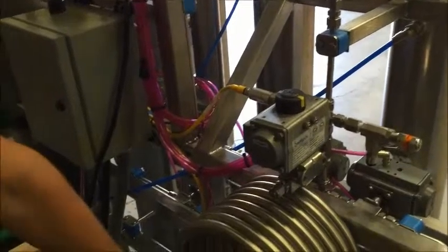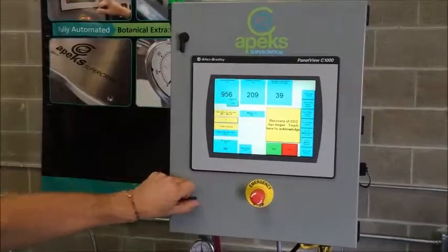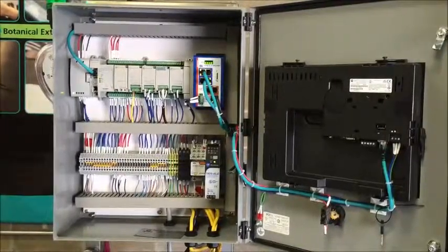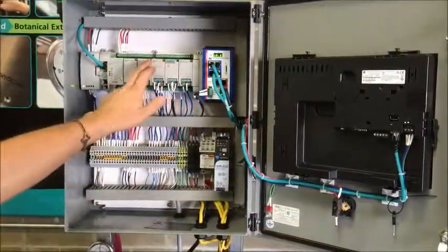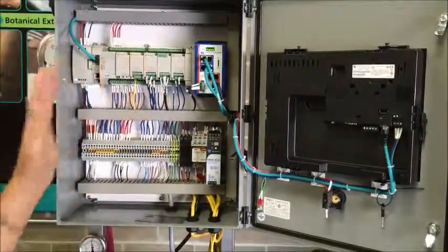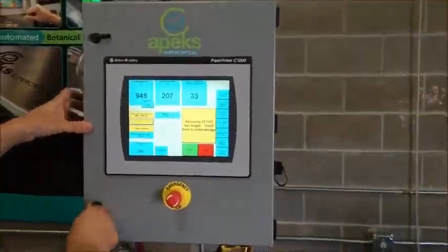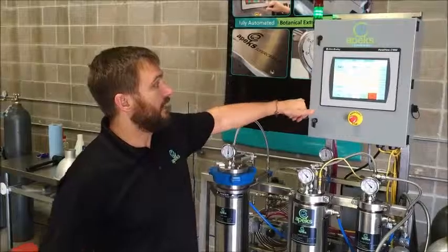The only other component is a small silent air compressor back here. It sends air through these pink lines, which is actually controlling all of our valves in the system. All of our controls are Allen Bradley, and all of this is done in-house in Ohio — we assemble everything here and do all of our own programming. Everything in here is extremely universal; a lot of people are familiar with Allen Bradley components. Every single one of these cards will be available for a long time, so in five years if something goes wrong in here, it's all extremely universal and replaceable.